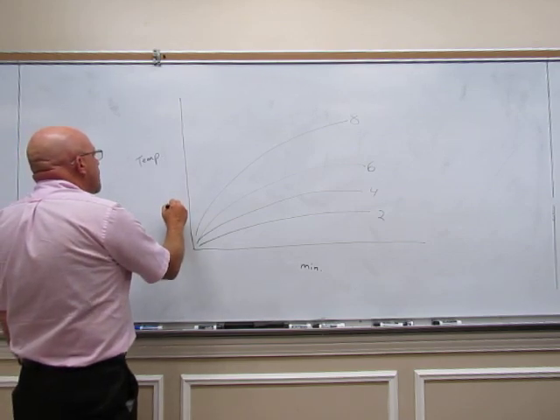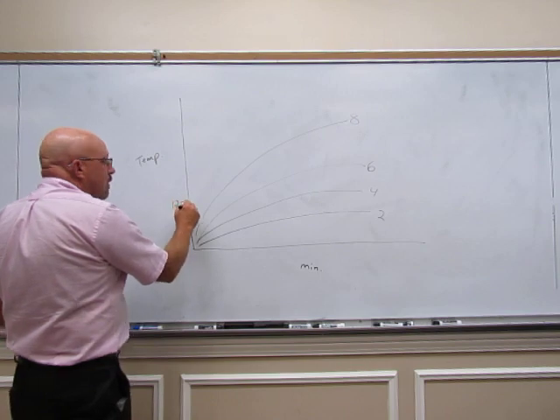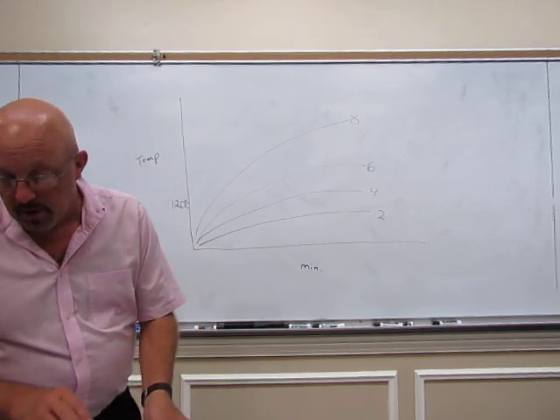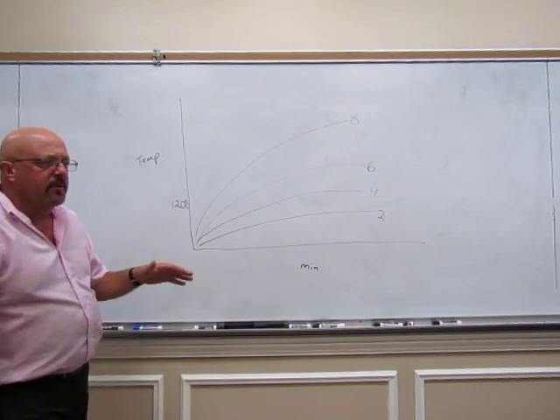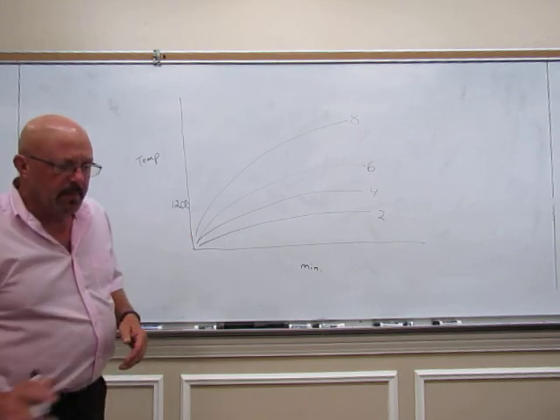So you're looking, I don't remember exactly what benzoic acid melts at. It's 120, 121, 122, 123, somewhere along in there. I know it's about 120 something.